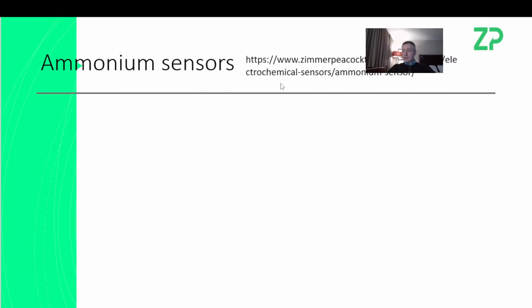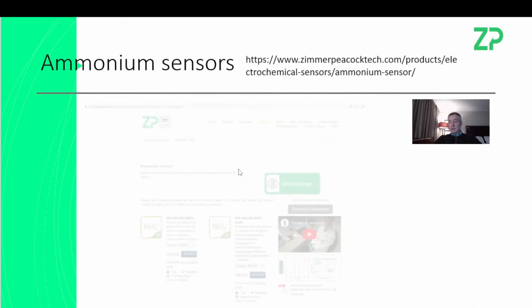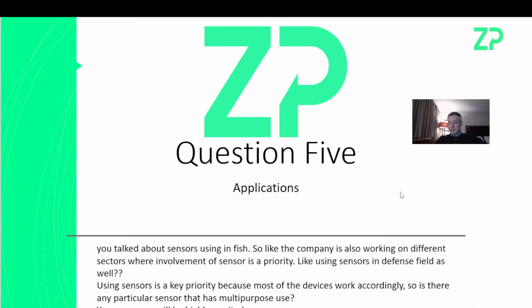Question number 4 was about specifications for ammonium sensors. Again, here's a link. When I say there's a link here, it's also underneath the video, because there's a page here. There's a data sheet here, there's some representative data here, and there's a good video here of us actually using that sensor. So this is what we have in the public domain. If you need more, then I think you'd have to come to a workshop and dig a little bit deeper with us.